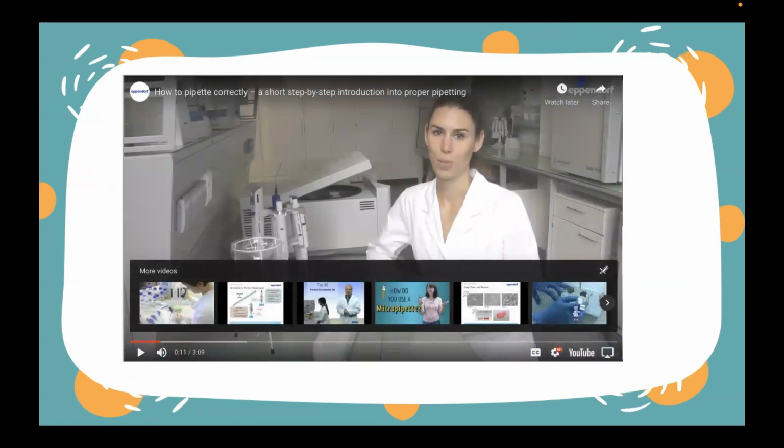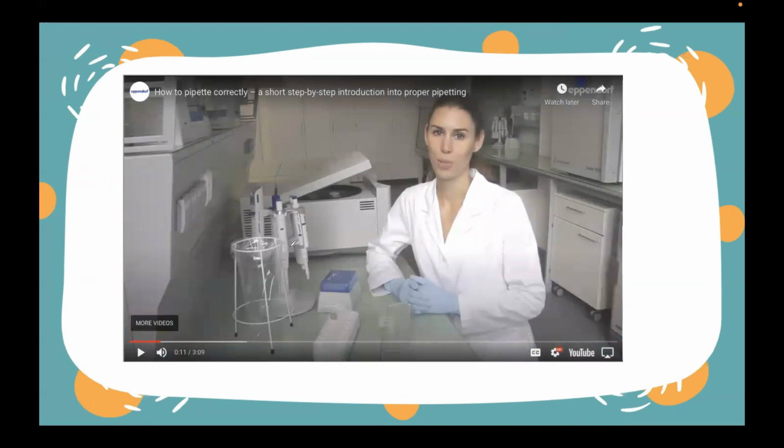Okay, so kung mapapansin po ninyo, ang ating mga micropipettes nasa pipette stand siya. If hindi po natin gagamitin yung ating mga pipettes or tapos na natin siyang gamitin, dapat ibabalik natin siya sa ating pipette stand. Kasi po, malakas daw ang tendency na masira yung mga pipette pag hindi po siya nakalagay sa tamang stand. Parang cellphone stand lang siya.